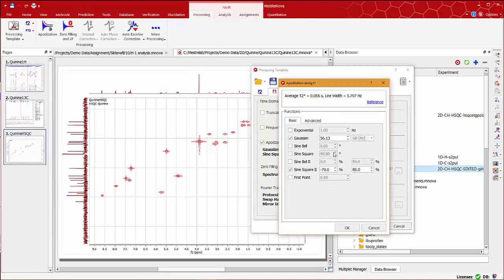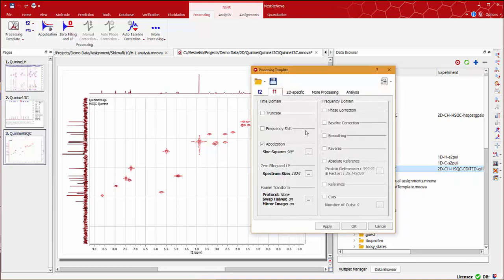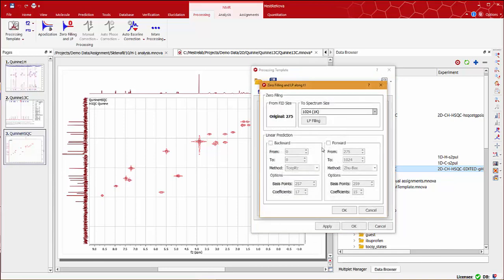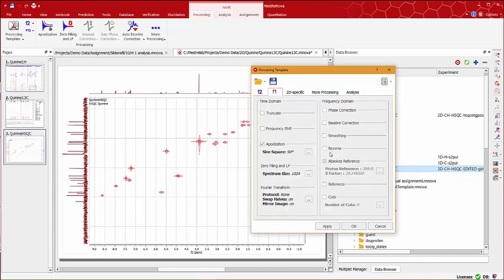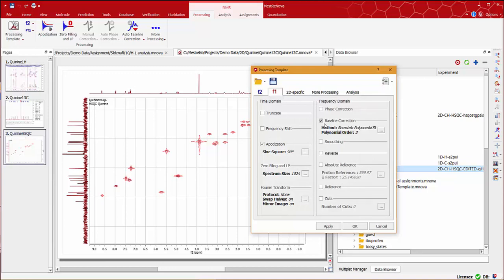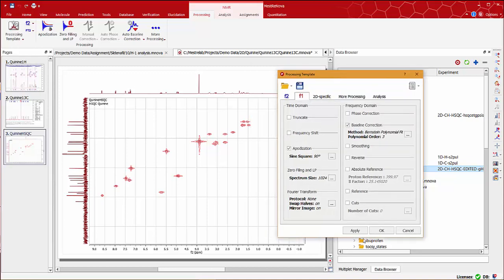Similarly, on the F1 dimension, I'm going to change the apodisation function also to sin290, change the number of data points to 1k in this case, and apply the same baseline correction function. Click apply to reprocess the spectrum and now we can already see better peak line shape.